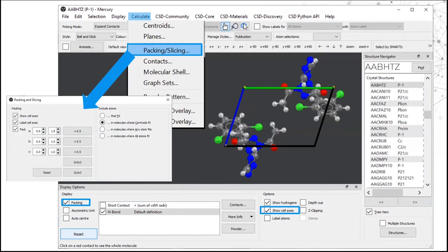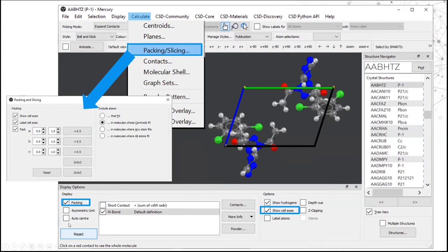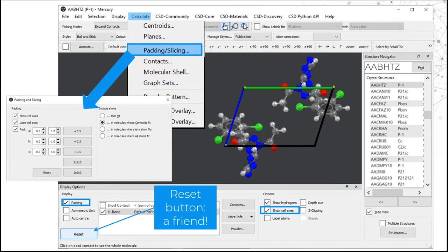Up until now we've been looking at display options for the molecule itself. If you want to explore the 3D nature of the crystal in more detail, you'll want to turn on packing — how the molecules pack together in the crystal. Go to Calculate, Packing and Slicing to get a pop-up where you can choose how many unit cells are displayed and whether unit cell axes are shown. Or use the display options toolbar at the bottom to turn on packing and show cell axes. Don't forget the reset button on the bottom left as you explore.